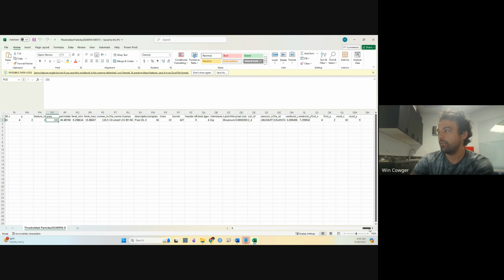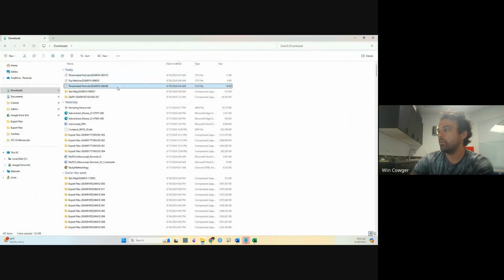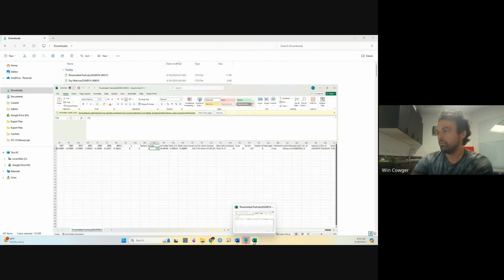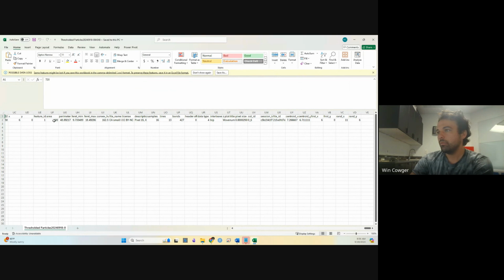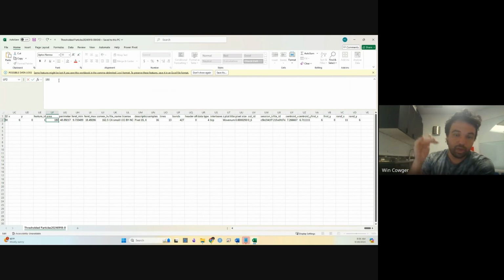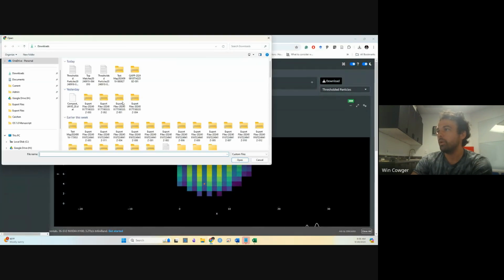So this area is 131 pixels. The other area was, I forget what it was. 180. So definitely a difference here in the region that was specified for using just the signal values versus the correlation values.